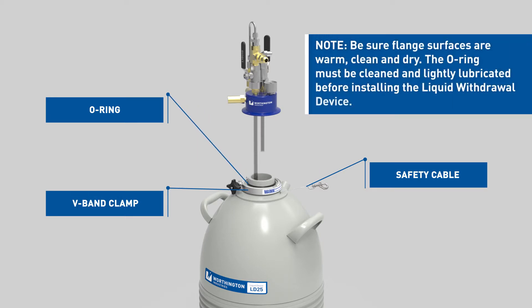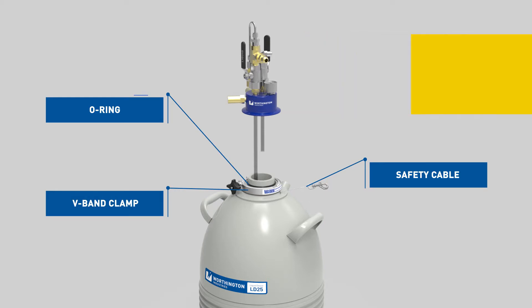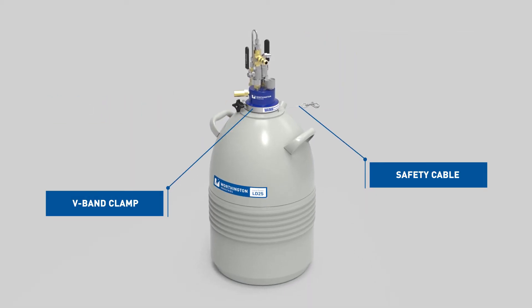Clean the flange O-ring and apply a thin layer of silicone grease before placing it on the grooved flange. Note: be sure flange surfaces are warm, clean, and dry. The O-ring must be cleaned and lightly lubricated before installing the liquid withdrawal device. Carefully lower the unit into the Dewar — it should rest firmly centered on the neck flange, and the tube should not touch the bottom of the Dewar.